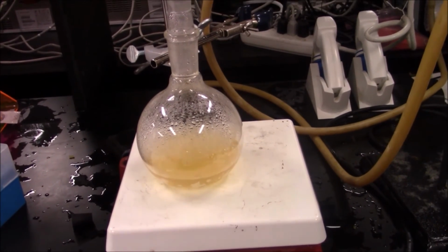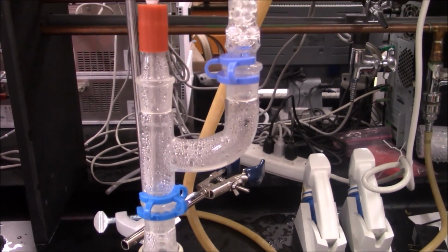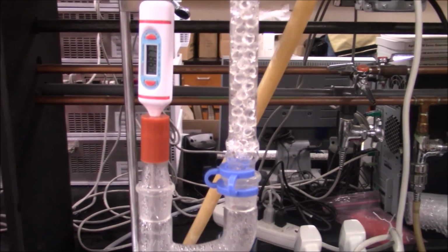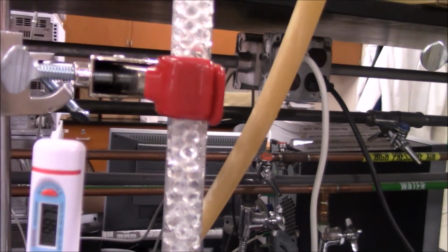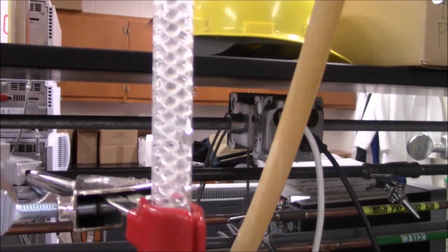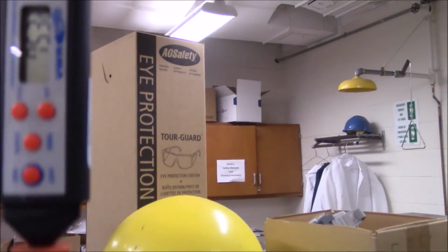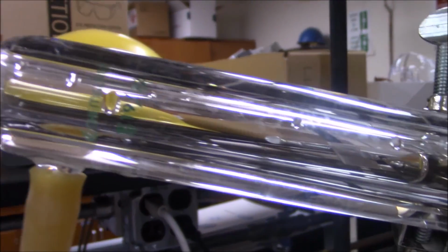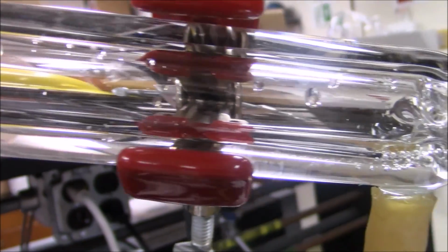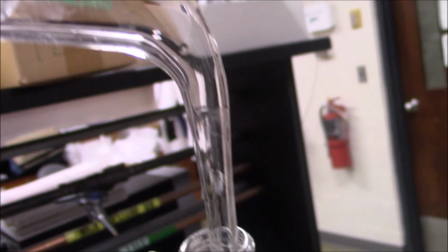At the beginning of distillation, the temperature of the vapor at the column top should be in the range of 70 to 80 degrees Celsius. The temperature of the top digital thermometer should gradually increase, and distillation should be stopped once it reaches 98 to 100 degrees Celsius. At this point, the vapor is almost entirely water because most of the ethanol has already been separated and collected. Vapor ethanol concentration can be estimated using temperature data and the vapor-liquid equilibrium curve. These estimates can be verified with density measurements, which will be done at the end of distillation.